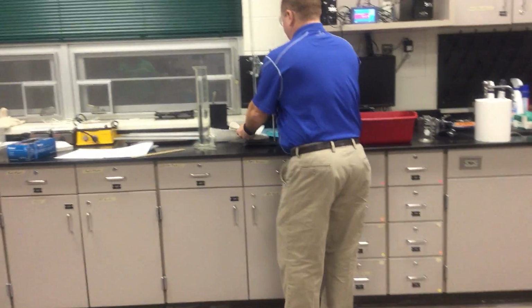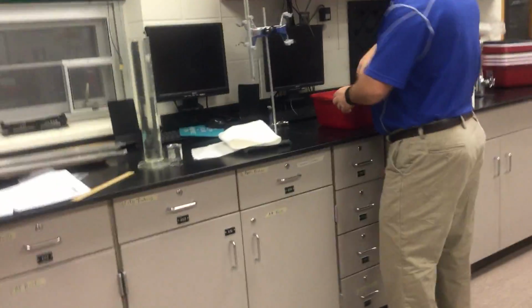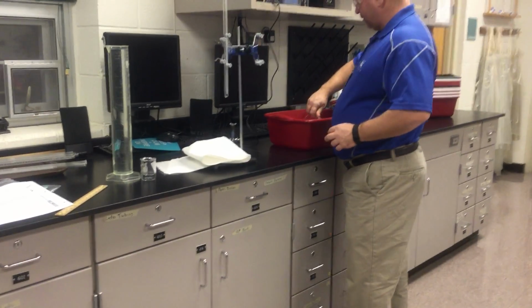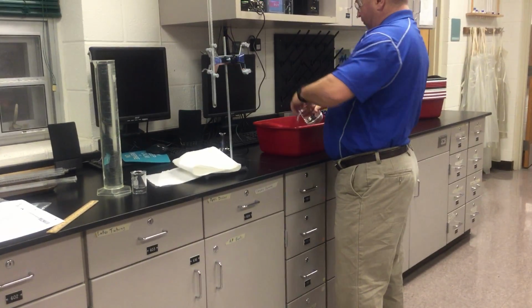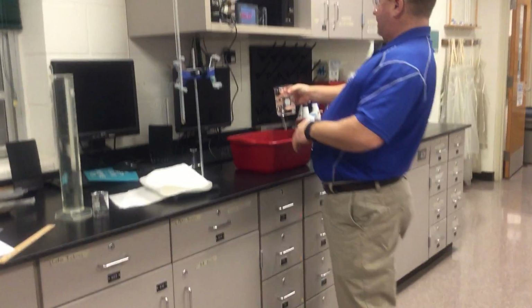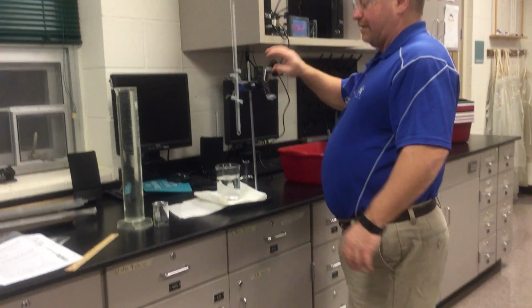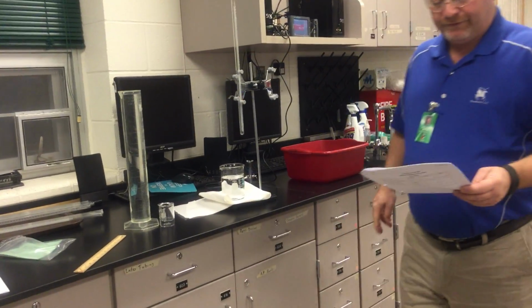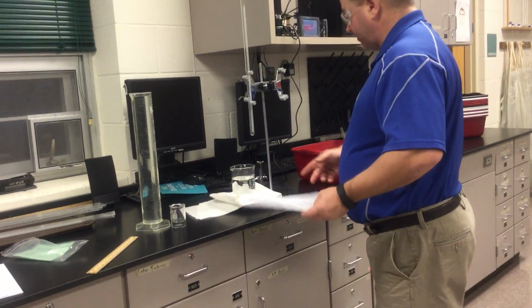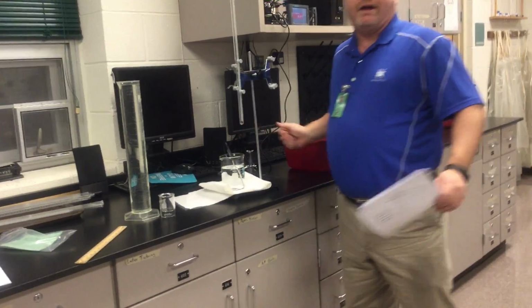I'll put my paper towel down here, fill it up 2/3 full of water. That's a little bit more than 2/3, about so. So I've got my beaker at 2/3 full of water. Okay. Make the temperature as close to room as possible. That should be as close to room temperature as possible, because we've had it sitting there for 2 days.